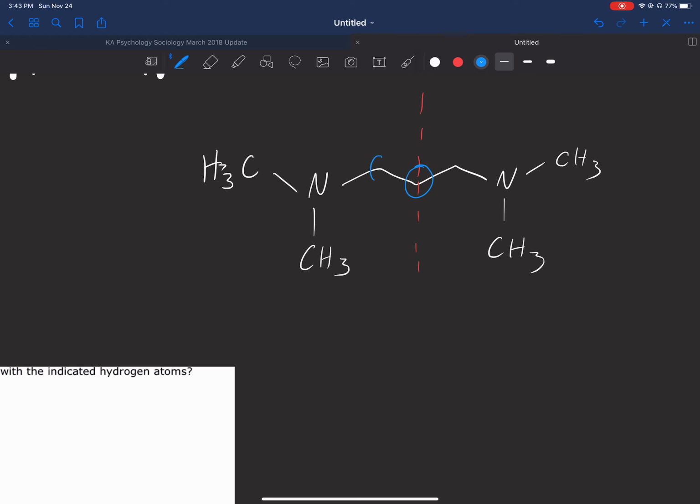Same exact thing for this carbon. But you're going to say, oh, we have this one over here. But remember, we're talking about unique carbons. CNMR doesn't pick up carbons that are the same. It only picks it up one time, so we're going to get one peak here, a second peak here, and we're not going to get a third one there. That's a repeat, so we still only have two.